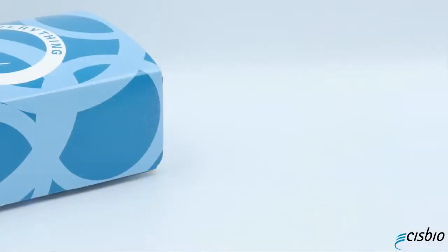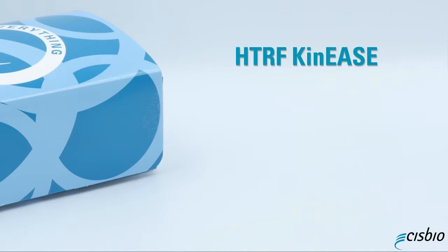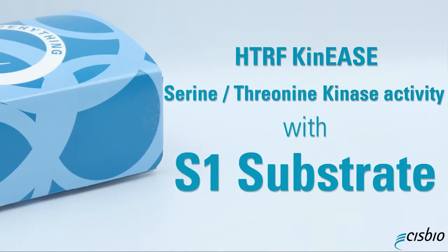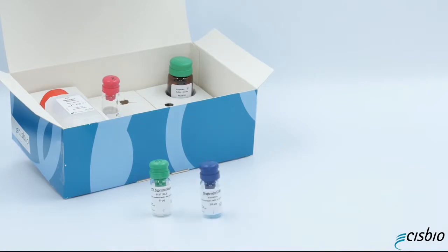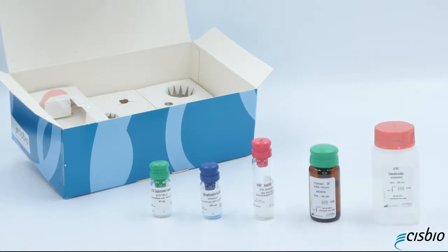Today we will show you how to proceed with the HTRF Kinase assay for measuring serine/threonine kinase activity with S1 substrate. The kit includes everything you need: STK substrate 1 biotin, streptavidin XL665, STK antibody cryptate, enzymatic buffer, and detection buffer.